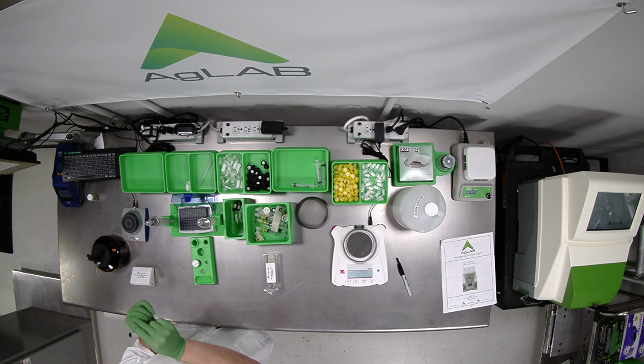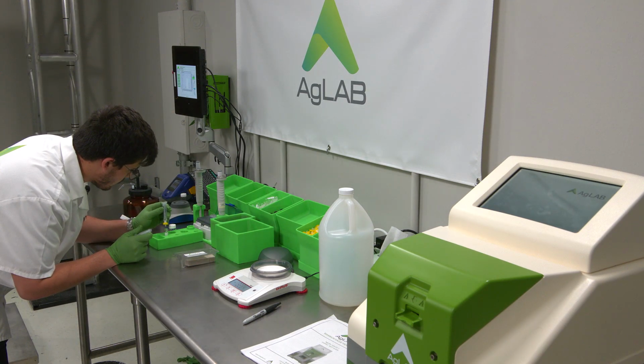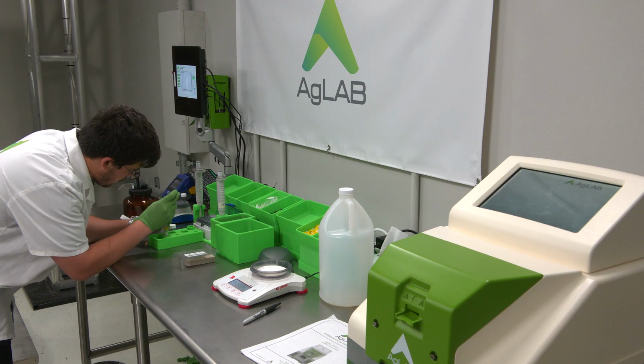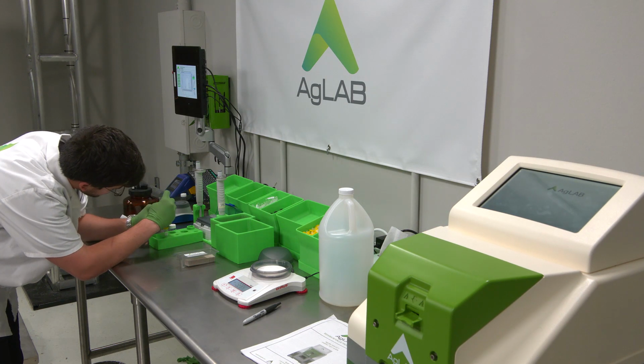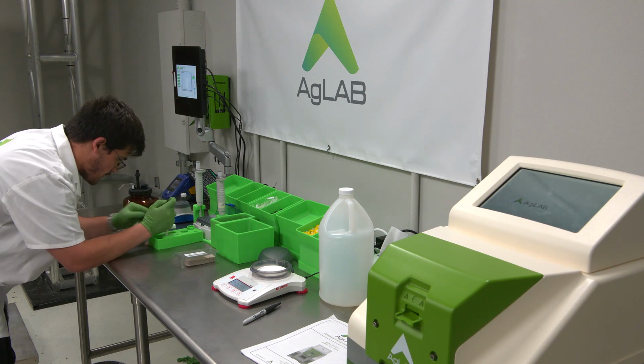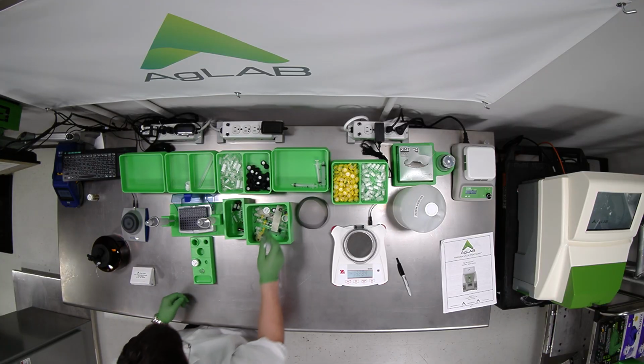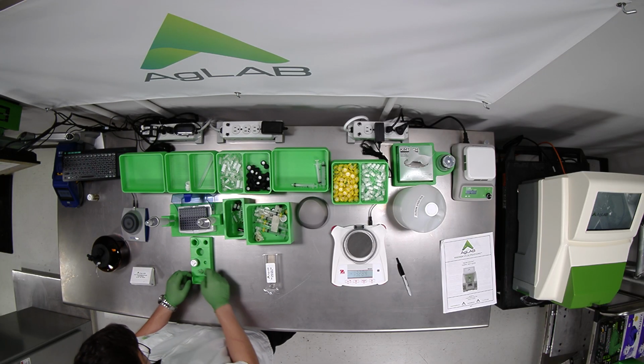And side note for this part, this transfer is obviously important as you're filtering your final solution. But if you don't make a complete transfer or you lose a little bit, it's fine, as long as you get enough to make your drop onto your swab and you have a sample that represents what you collected.